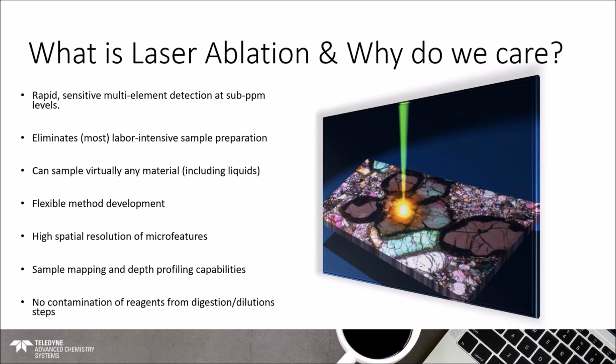I always take pause there to say that I get questions from folks who ask if they're able to just take any sample and place it in a sample chamber and ablate it. And the answer most of the time is, yeah, kinda. Like anything else, the better the sample I put in, the better the end result will be.